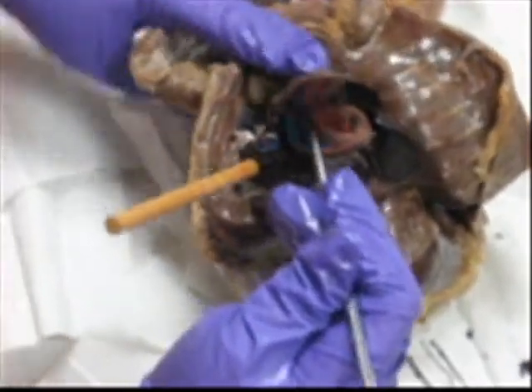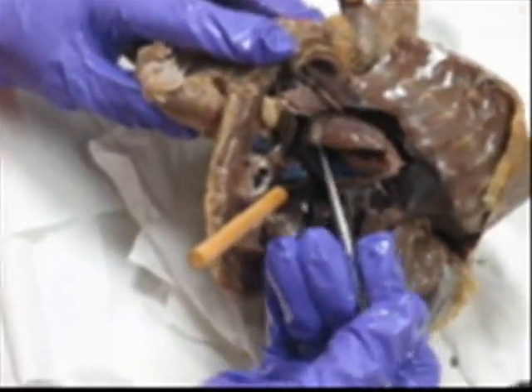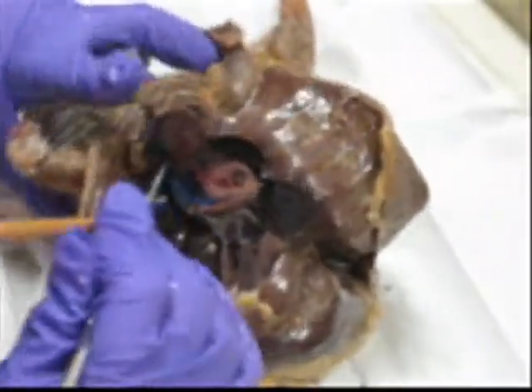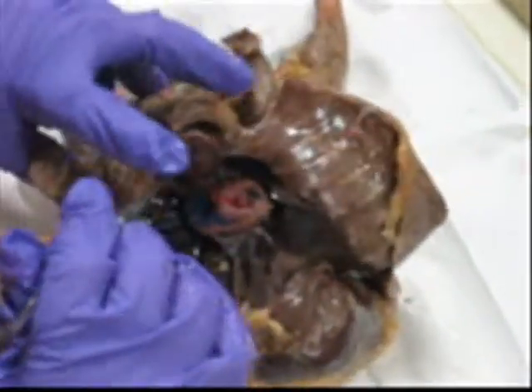If I were to stick this in here, I would be affecting or going into the auricle. Because the auricle is an extension of the atria.